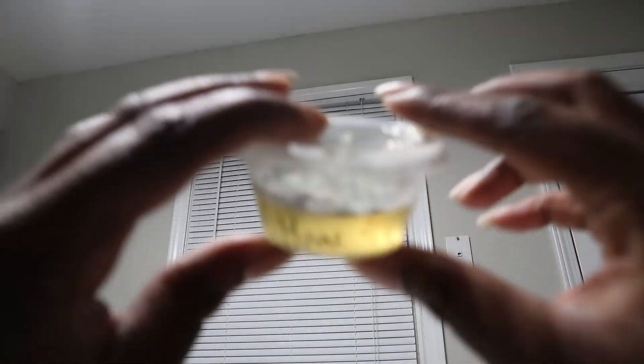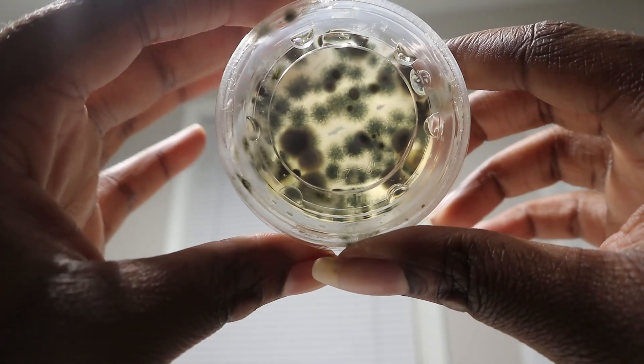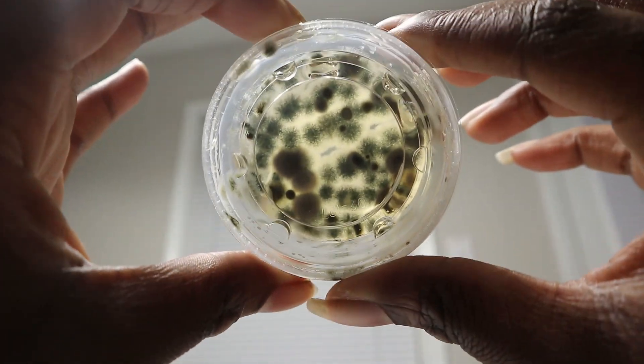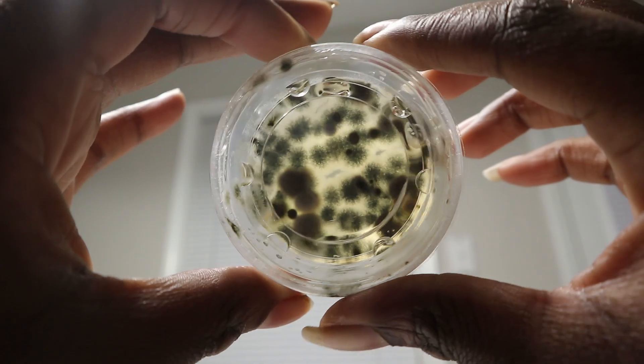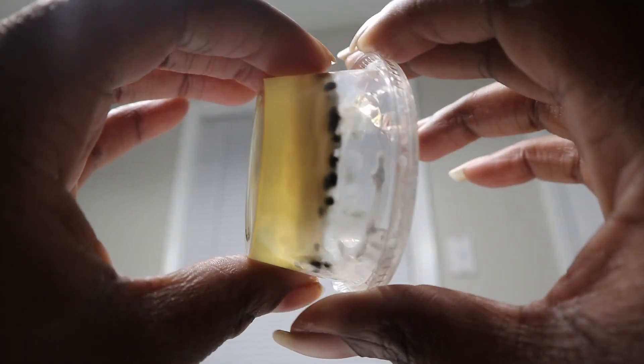So we're here for day eight of our results. I'm just going to show you all the ones that really took off. The first one was the HVAC — it had a lot of greenish-blackish colonies growing inside of it with a lot of white fuzz, if I was to describe it.